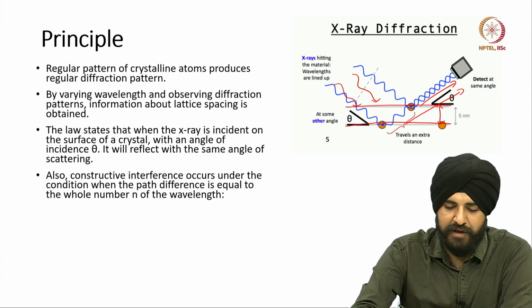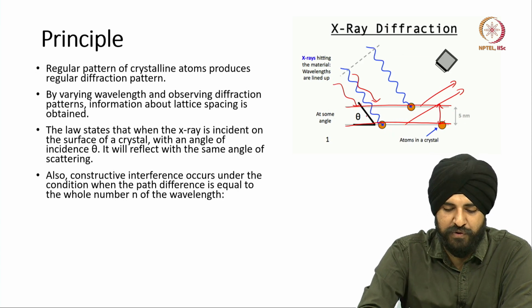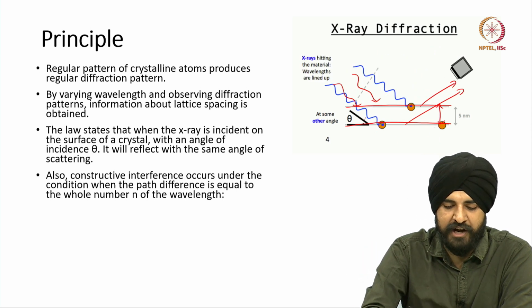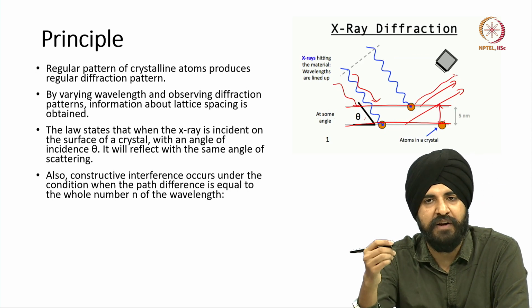As you can see, when it falls at this angle, the waves are not meeting constructively, but at a particular angle, these waves interfere constructively.